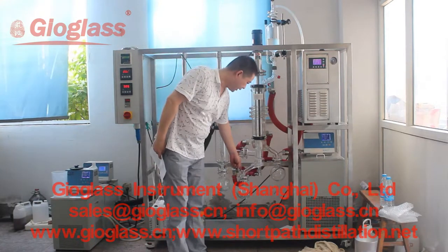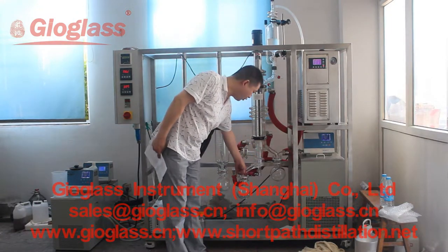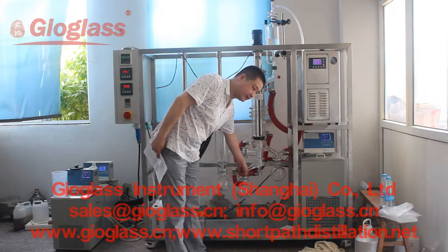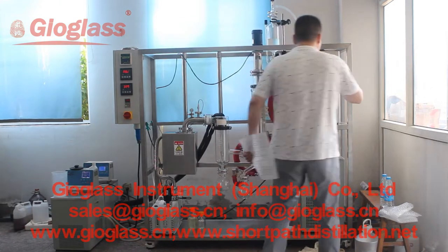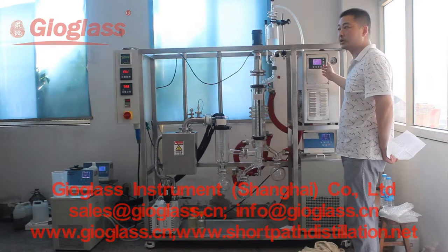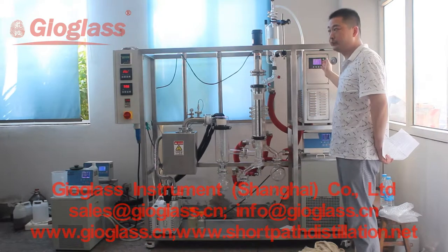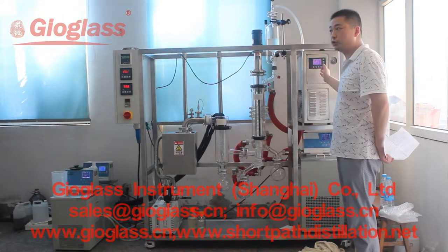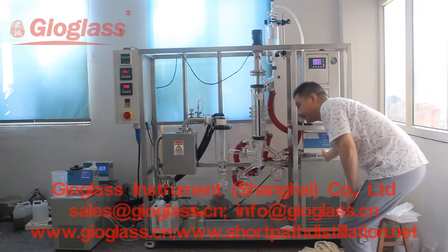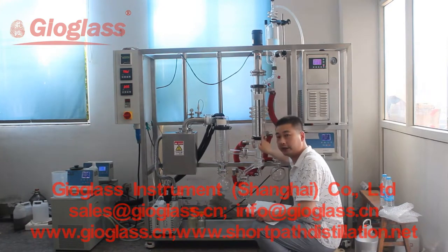After running, we can see the finished product will be received here in this flask. This is the closed heating circulator, and the temperature can be heated to 300°C. And this is our chiller to cool the inner condenser here.